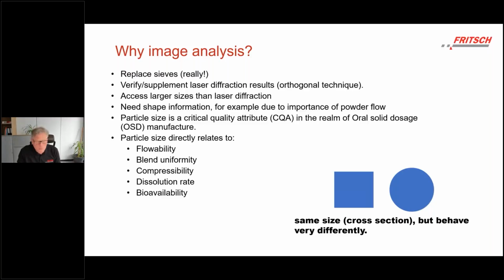And of course, when it comes to larger particles, really in the several hundred microns, thousands of microns, millimeter range, it is much easier to measure those particles with a camera-based system than with a laser diffraction instrument.